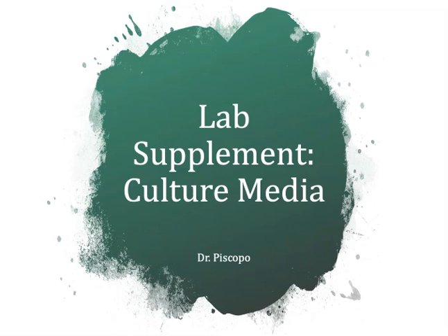In today's video, we're going to be talking about the different types of culture media, including a type of media called the special media.